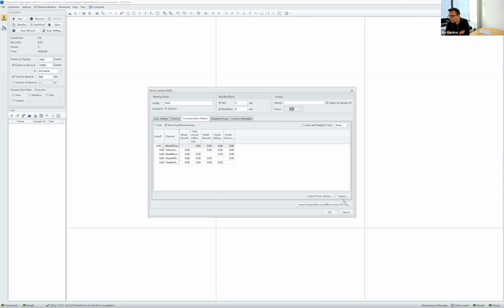Because my panels have multiple 12 color stains, I don't have time to go through all the MFI values, but I don't trust the comp the instrument software calculates. So essentially they're having a lot of issues with trying to comp with different gains, and even running fresh controls. I would just say a few things, Kathy, before you answer.